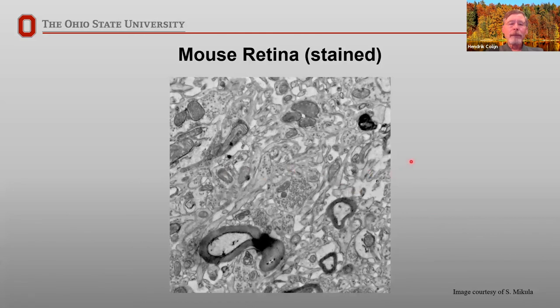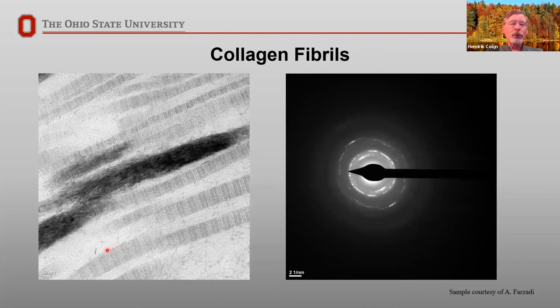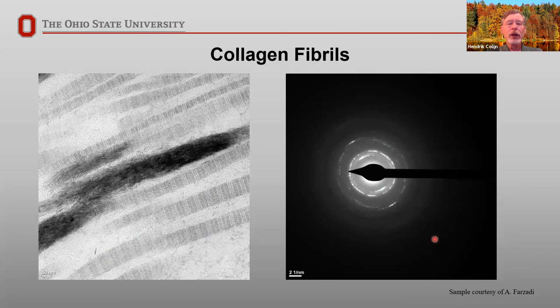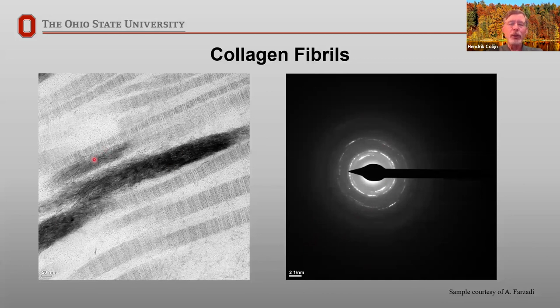We can extend that to collagen fibrils. Here's a TEM image of collagen fibrils showing the characteristic bands. You can actually perform diffraction analysis to measure those bands and calculate what kind of structure they have — this becomes complementary to the image, and you can sometimes get spacings much more precisely from the diffraction pattern than from the image directly.